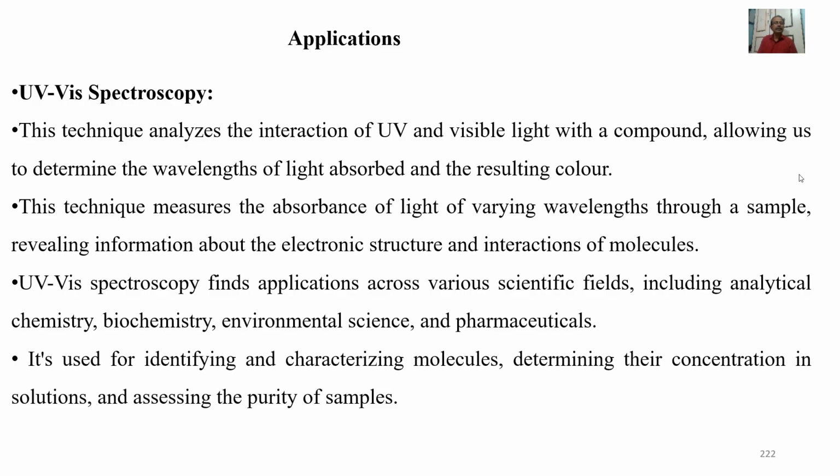This technique analyzes the interaction of UV and visible light with a compound, allowing us to determine the wavelengths of light absorbed and the resulting color. This technique measures the absorbance of light of varying wavelengths through a sample, revealing information about the electronic structure and interaction of molecules.